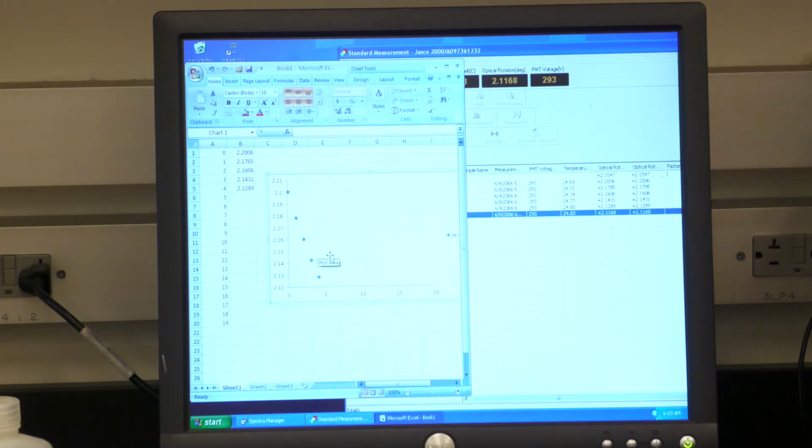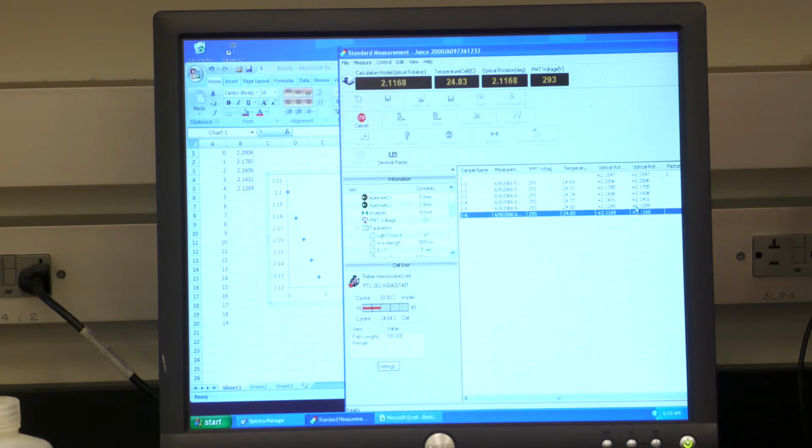After you do this one, save this data. You need to use the computer simulation in the next room. Okay, it's a computer room. Now you can see just let them go. Okay, so after you finish this one, this is your 8 molarity. Then you do the 4 molarity. You do the 6 molarity. So after you finish this one, you need to change the temperature.